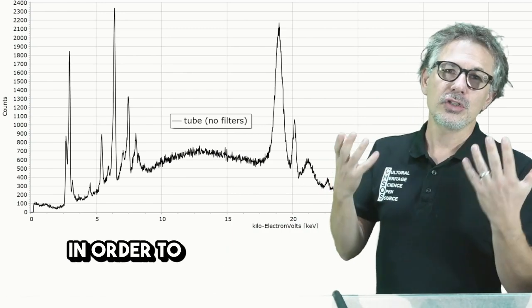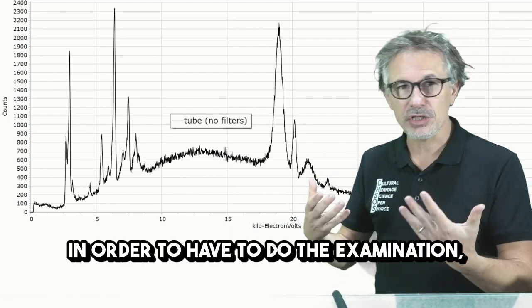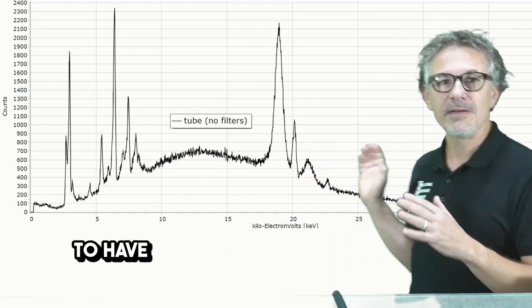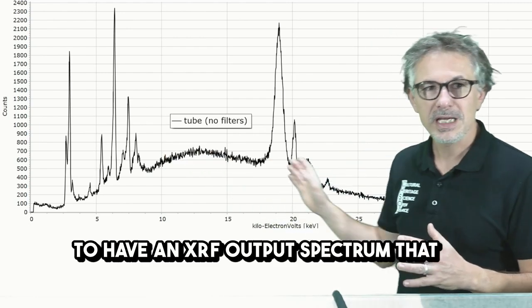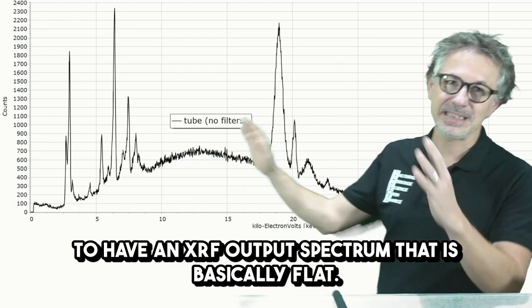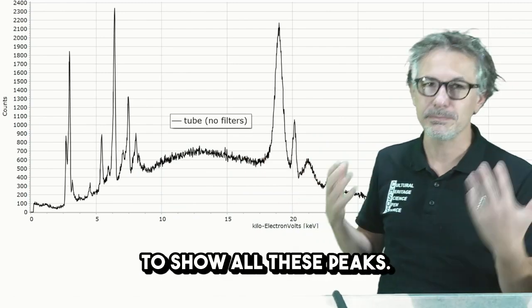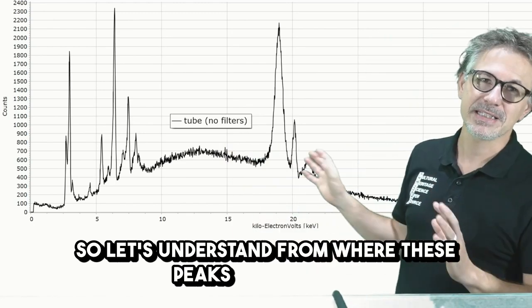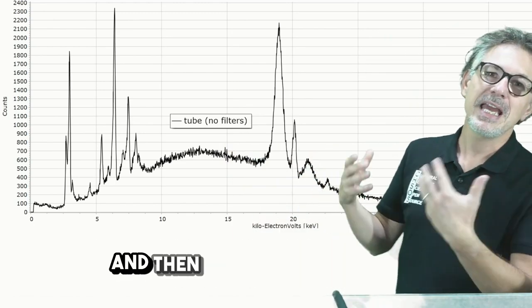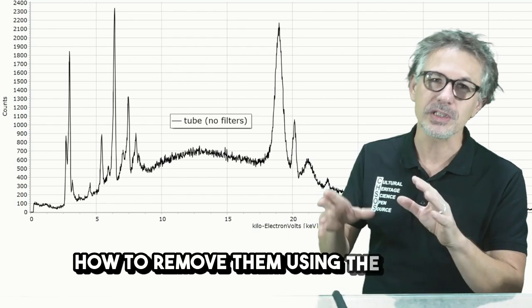In order to do the examination, we need to have an XRF output spectrum that is basically flat, so some curve, but doesn't have to show all these peaks. So let's understand from where these peaks come from, and then we can start to think how to remove them using the filters.